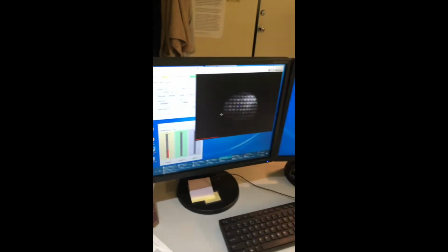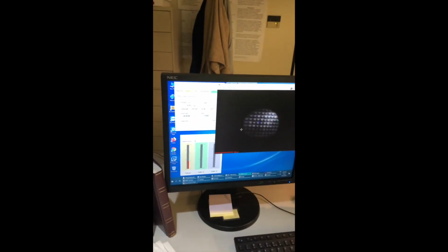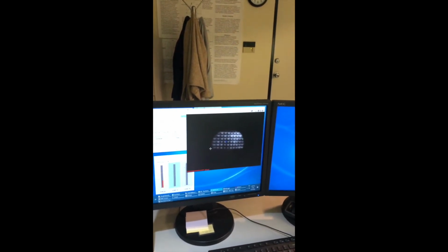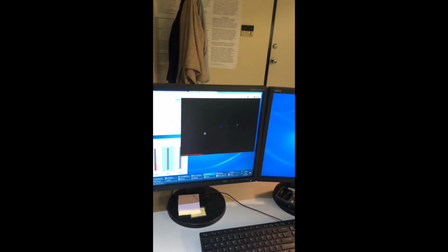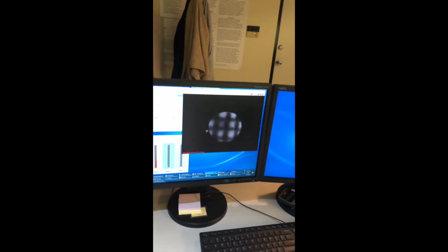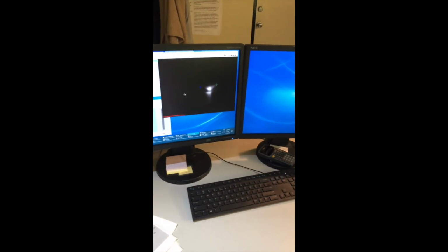Now, what I'm going to do is decrease the current, because that's not a microbeam. By the way, each one of those squares is about 20 microns across, and if I turn down the current, I can take the spot down to, that's about a 3 micron spot. Now, let me go back. I can also change the field of view on it, just like having objective lenses in an optical microscope. Now if I turn the current down, there. Now I've got a beam that I can hide behind a 10 micron copper wire, almost. But this is something we can't do on the phone.